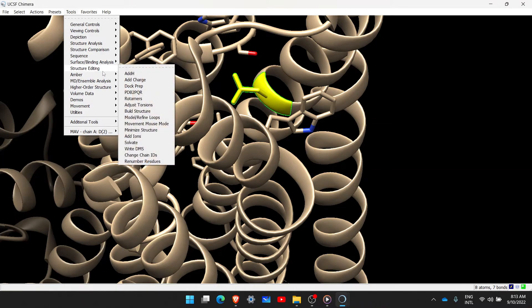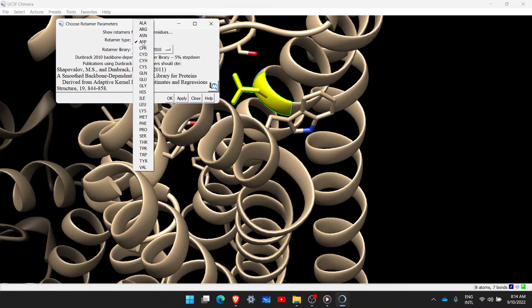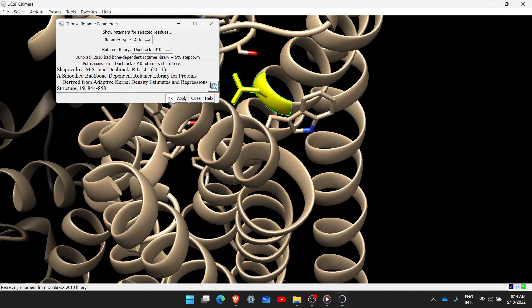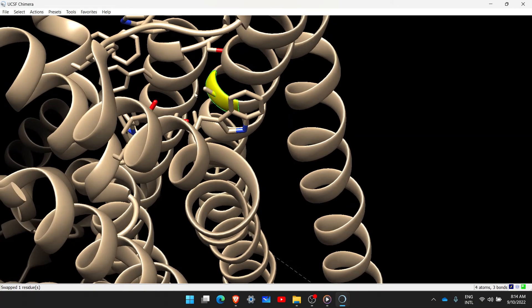Now we want to replace this amino acid. Go to Tools > Structure Editing, and select the Rotamers option. It confirms that we have selected aspartate and asks which amino acid we want to change it to. We select alanine — a neutral amino acid — and press OK. It has simply replaced the amino acid. This is one straightforward way you can perform the substitution.